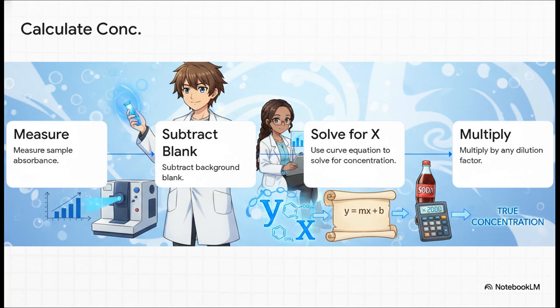Boom! There's your concentration. But wait, do not forget to multiply your final answer by any dilution factors you used during sample prep. If you diluted a soft drink 2,000-fold before the assay, you literally have to multiply your final x by 2,000 to get the true original concentration. Don't trip up on that.